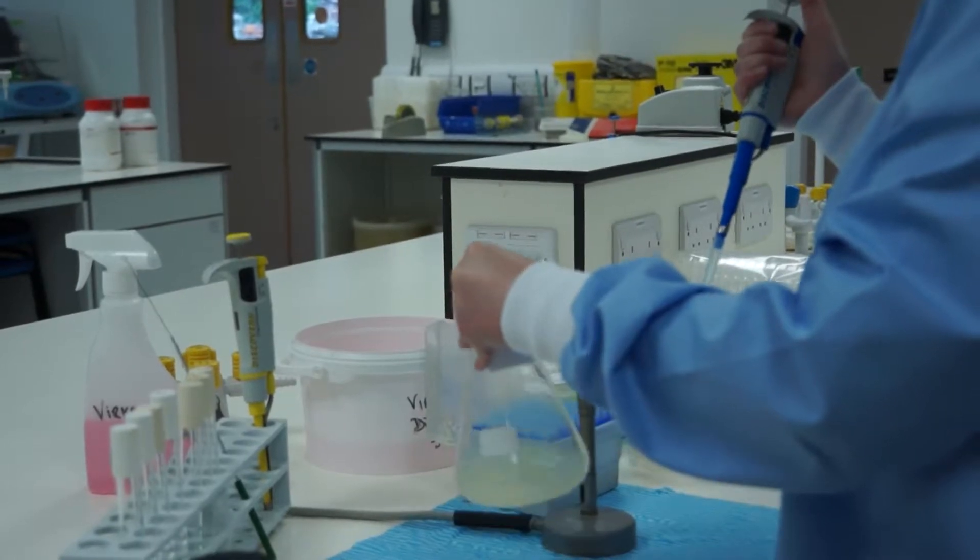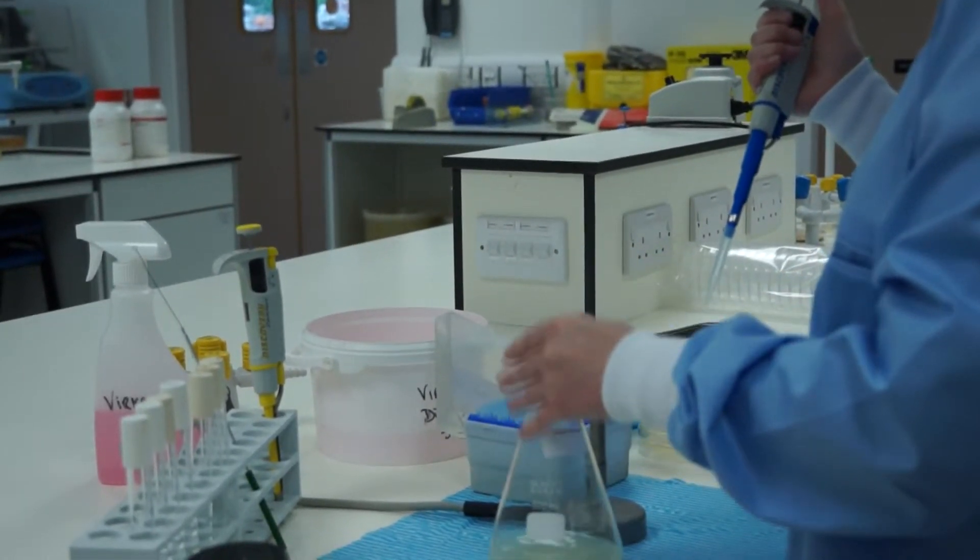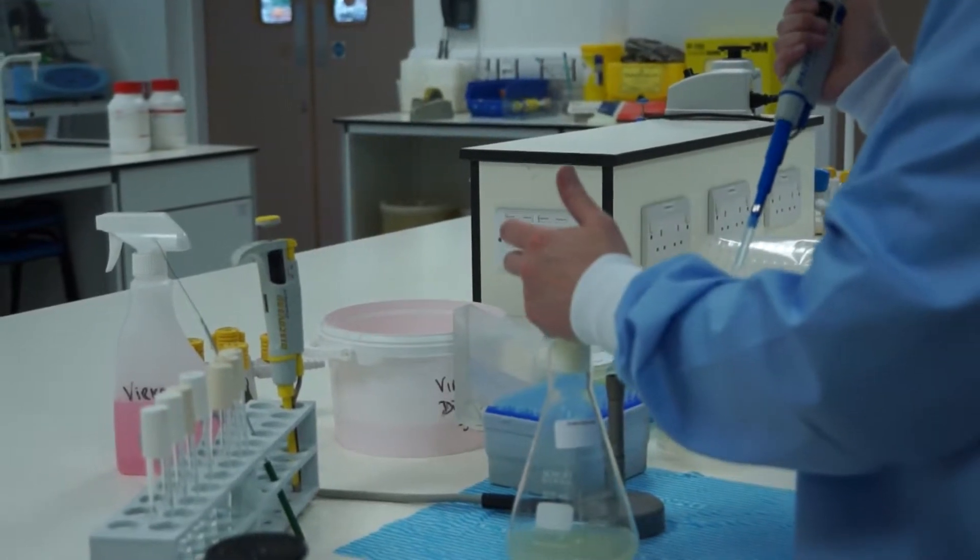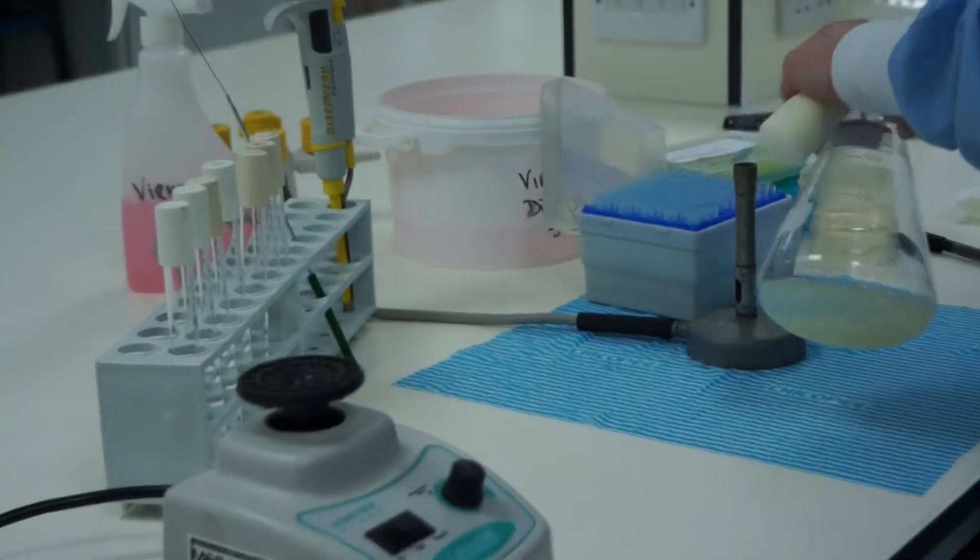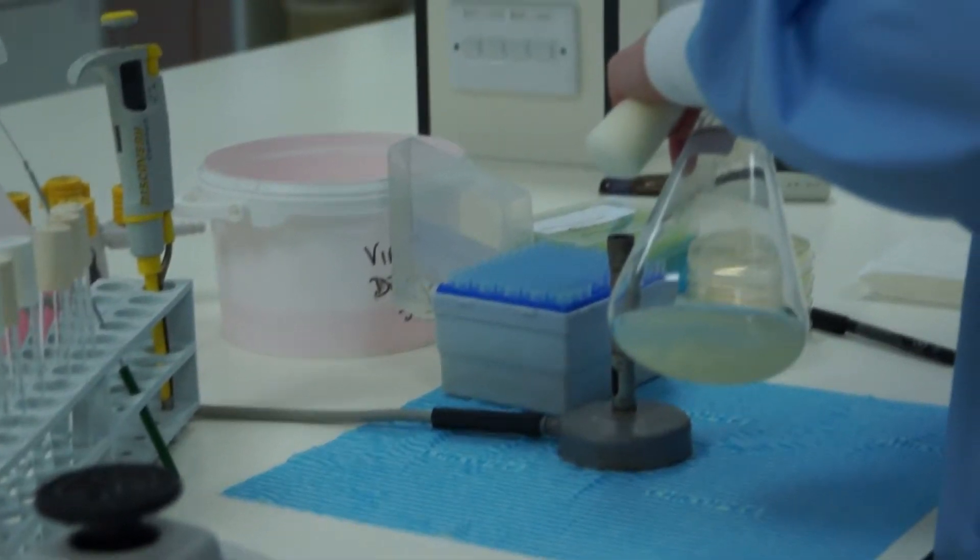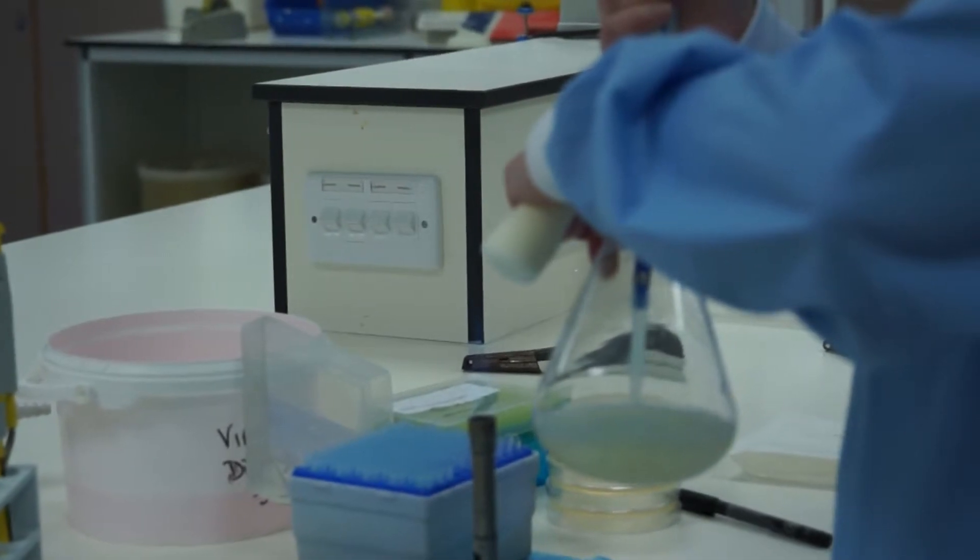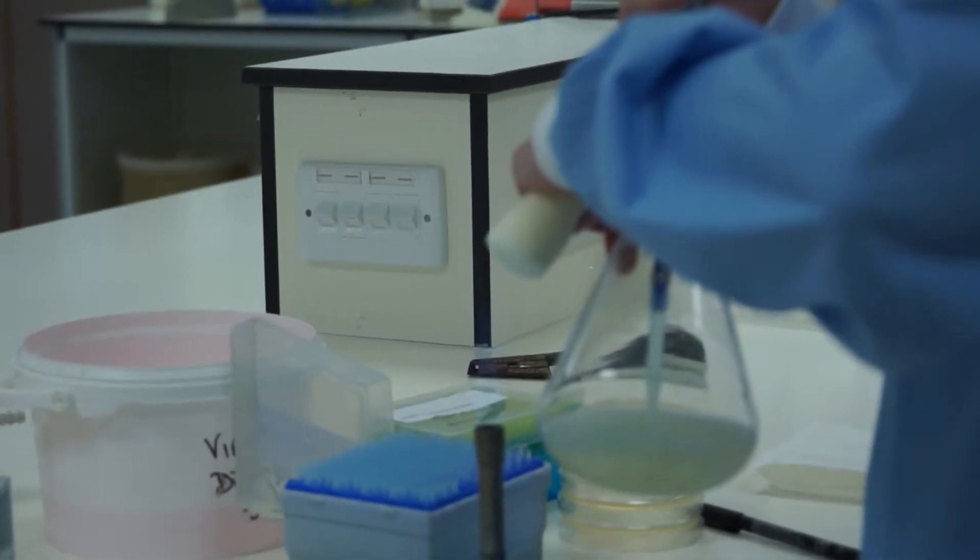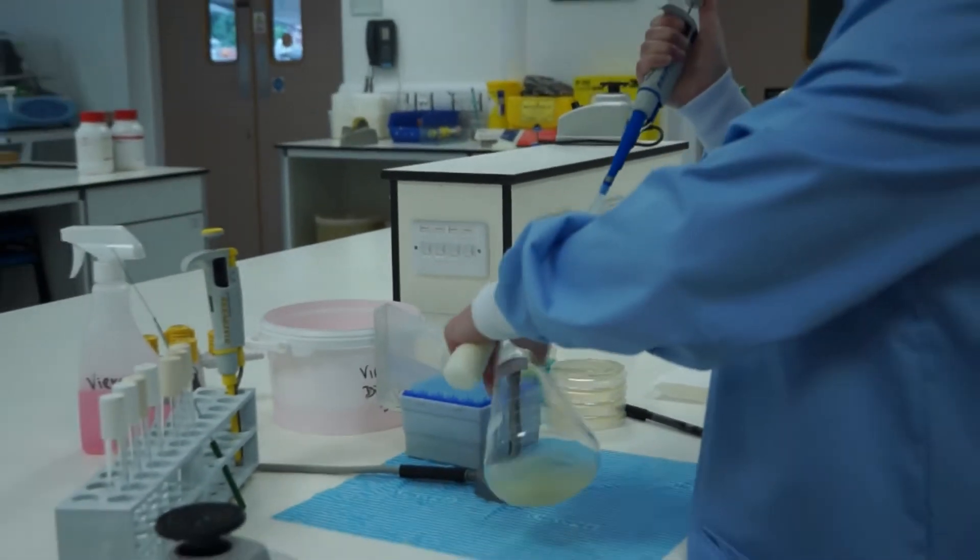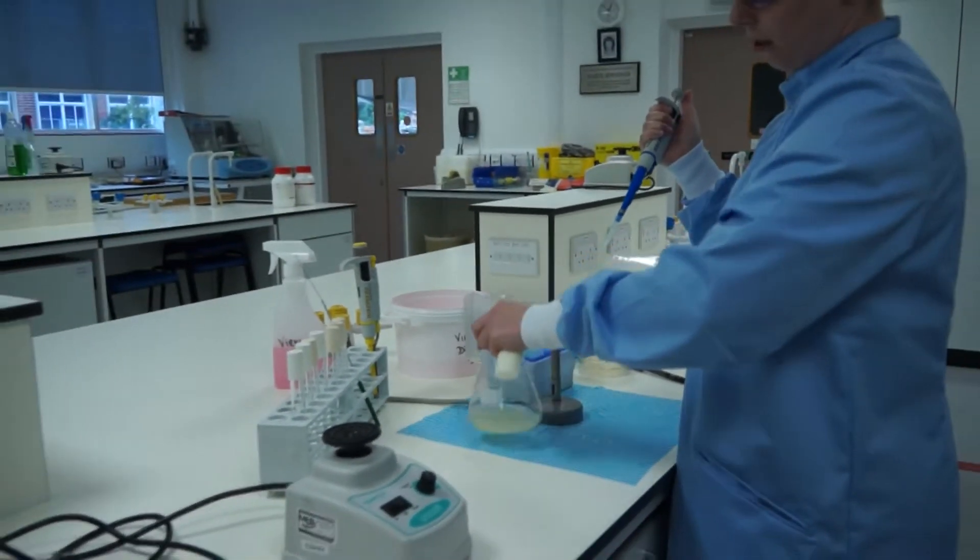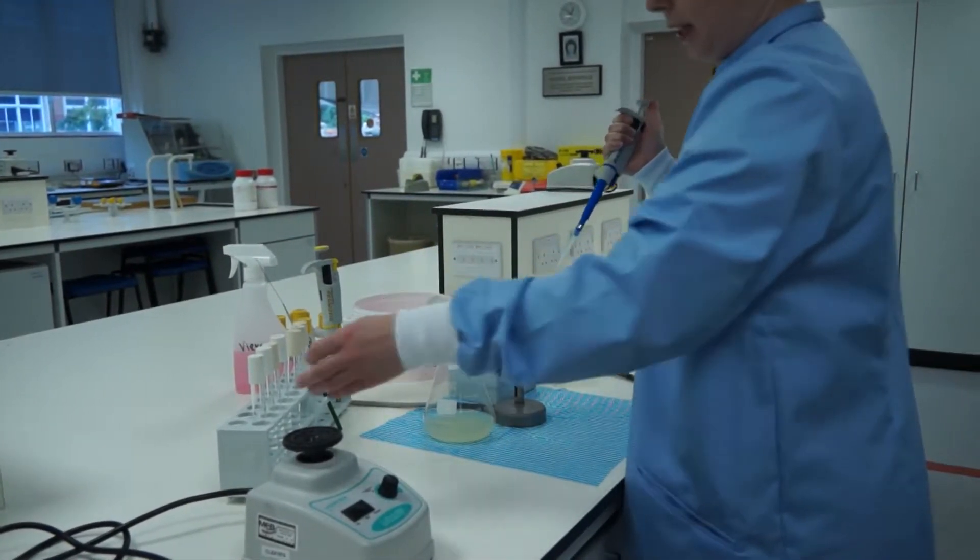Mix our E. coli culture to make sure that our bacteria haven't sunk to the bottom. Remove the bung. Bring the finger. Flame the neck. Expel the air down to the first stop. Put in the tip without touching the bottom of the neck. Slowly release the pressure to draw up the liquid. Making sure not to release too quickly and cause the liquid to jump. Flame the neck. Replace the bung.